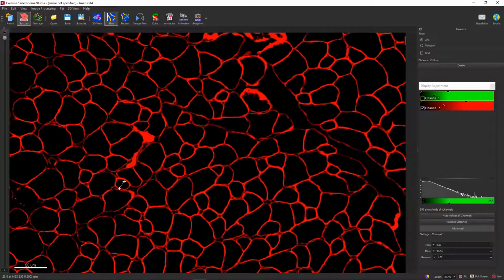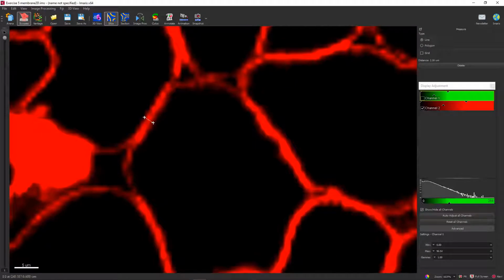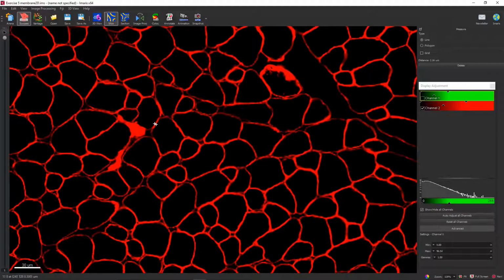And then the membrane detail. Again, what does the membrane detail mean? So the membrane detail is more relevant to how smooth or how curved are the borders of the cell. In this case, we can see there is nothing really extreme going on. So the number does not need to be very small, but generally what works very well here is the thickness of the membrane. So if I measure the thinner membrane around 2 microns, this is a parameter which would work well. If you have nicely round shapes like this, the number could be bigger.